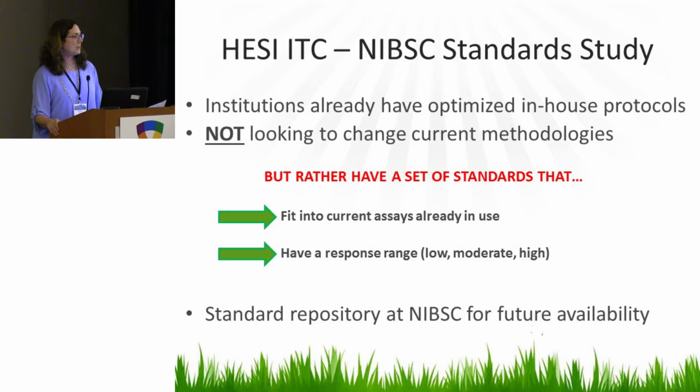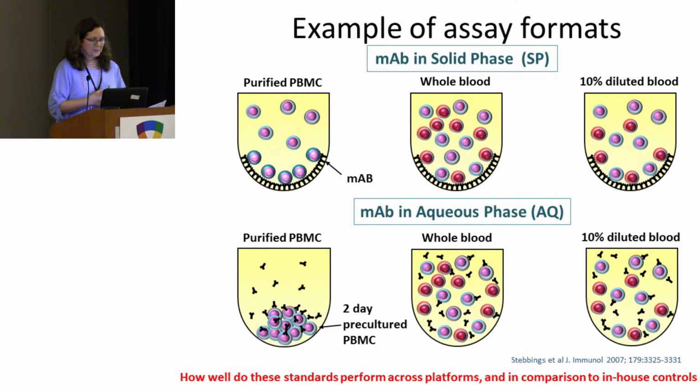There will be a standard repository at the National Institute for Biological Standards and Control, which we'll all be able to use. So the basic assay is put drug in cells, in wells, and incubate and measure cytokines. But there's a variety of assay formats, and this is done with or without immobilizing the drug and/or the cells.